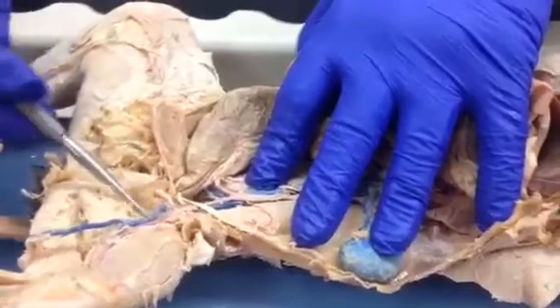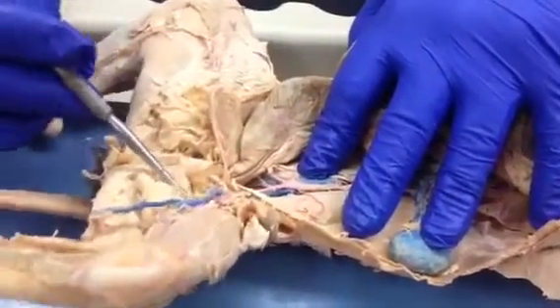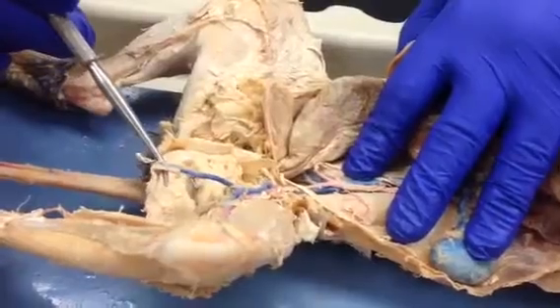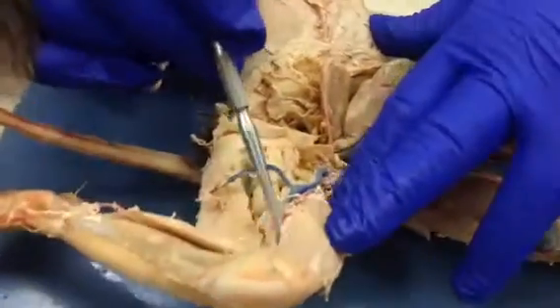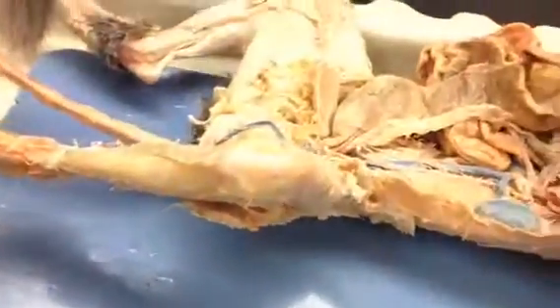The iliac penetrates the body wall. We have the femoral artery, vein, and nerve right here, all in that one spot. The nerve is underneath here. It's a little white structure I'm pulling up on now. It continues down the inside of the leg just beneath the surface of the saphenous, and continues deep to the deep popliteal. The popliteal artery and vein continue down below the knee, and they would split into the tibials, but we didn't go that far.